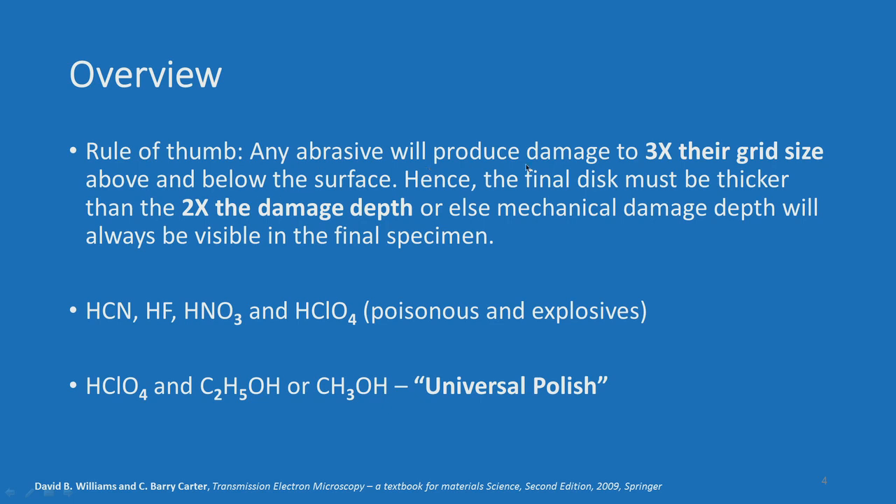A rule of thumb is any abrasive will produce damage to 3 times its grit size above and below the surface. Hence the final disc must be thicker than 2x the damage depth, or else the mechanical damage will always be visible in the final specimen. We are simply talking about mechanical filing — the specimen is rubbed against emery paper or an abrasive paper. You have to be very careful because the abrasive paper will produce damage up to 3 times its grit size, so a very fine emery paper is needed for a thin sample.